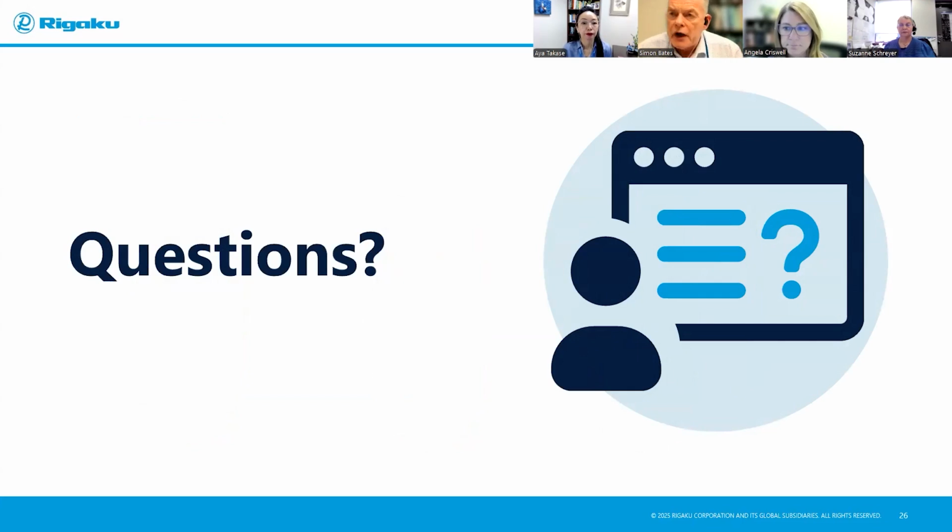Yes, Angela, we have a couple of questions. The first one is, can you look at more than one tablet at the same time? Absolutely. There are different ways in which you can do that. For example, sometimes you can just image the entire bottle and image them all at one time. You can also just space them separately apart. There are also sample changers. So if it's important to you to image just a couple at a time, then our instruments have sample changers that will mount the sample, image it, put it back, and exchange it for the next one. So there are lots of ways that you can do that.